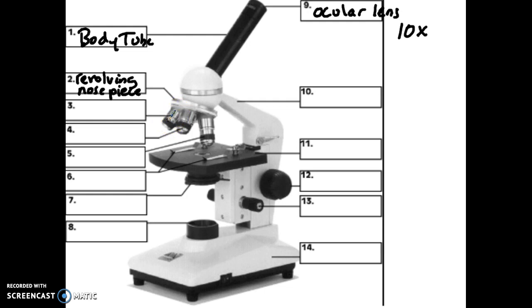Many students will get confused there. Number three, which is the smallest of the objective lens, this is called the scanning power. And they are an objective lens, so I don't have enough room to write the whole thing objective. What this objective lens does is it magnifies because it has that lens characteristic. This, most often, for a scanning power, is four times.